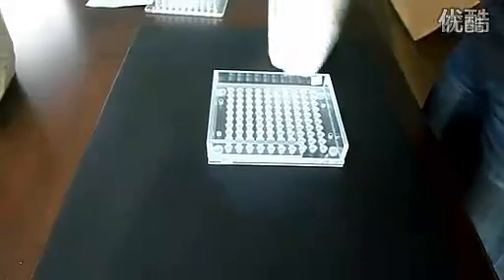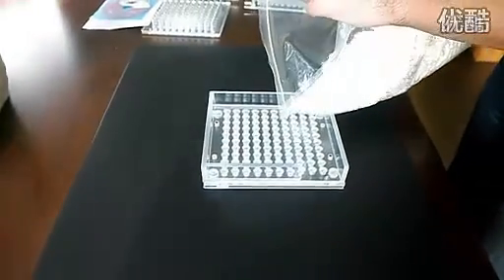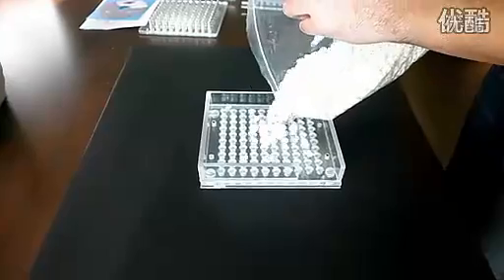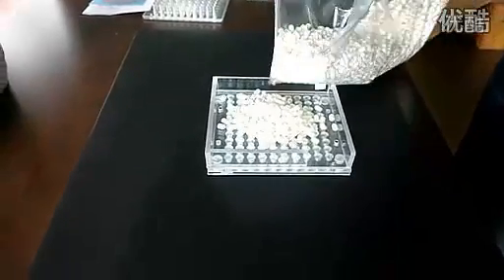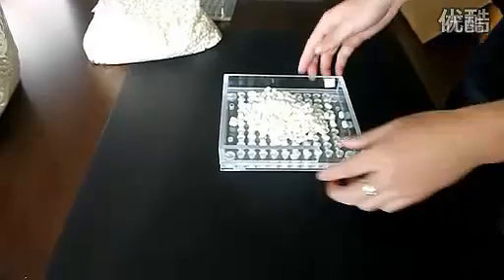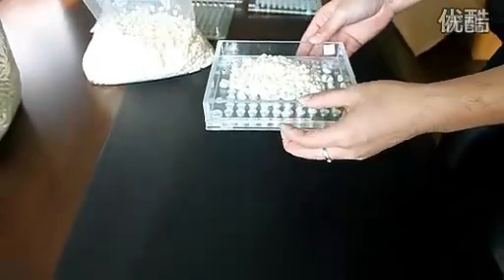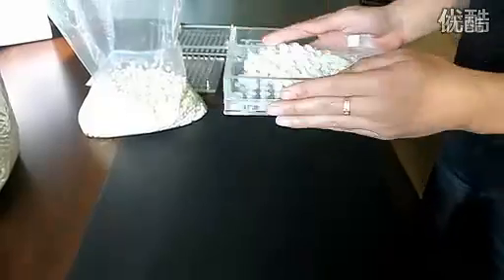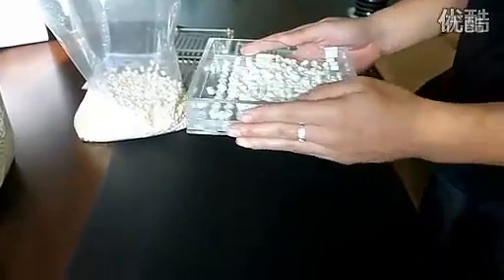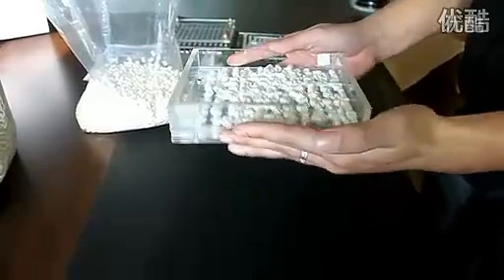Pour capsule tops into the encapsulation sheet. Using a circular motion, gently shake the tops into the holes. While doing this, cover the gap in the wall of the encapsulation sheet with one hand to avoid spilling the tops.